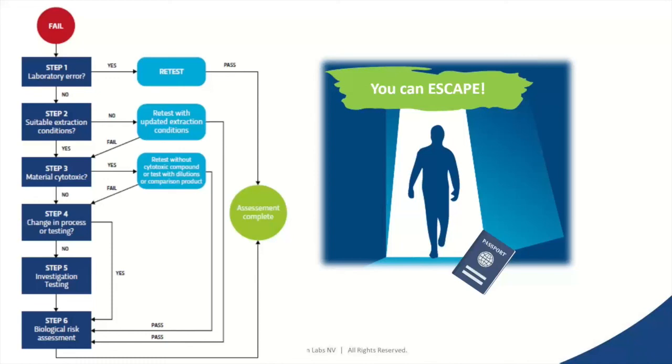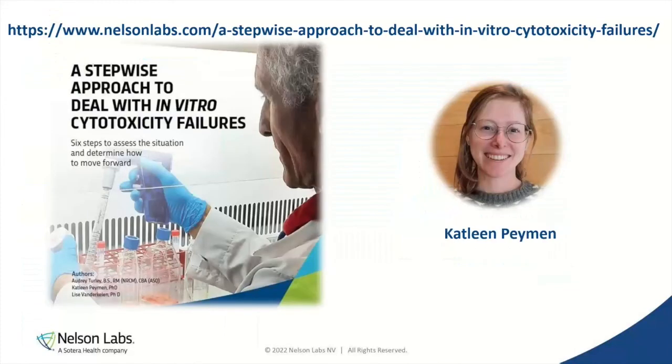Look at your device. How is it in contact with the patient, and does it contain a potential problem? Is it the danger? Is it a risk? Yes or no? And with that approach, with step 1 to 6, if you follow that in the right order, I think it's very important, follow it in the right order, your story is shorter, you can really escape. So that's for us, for the talk today.